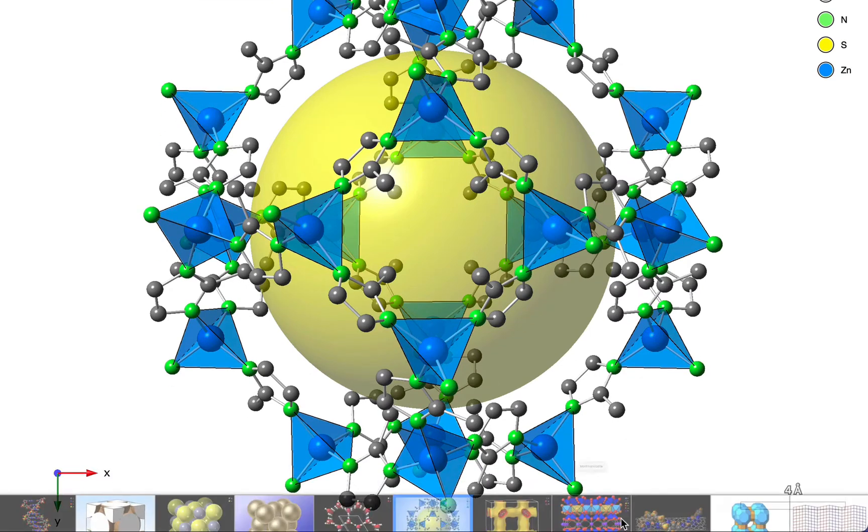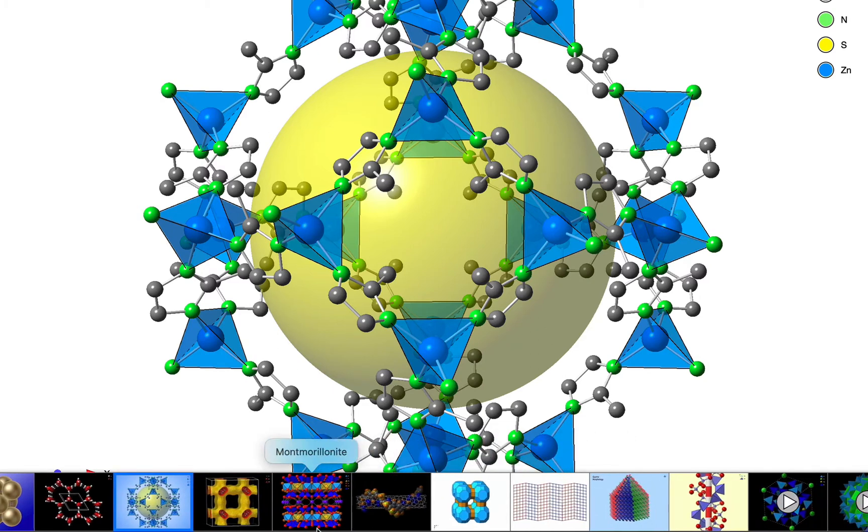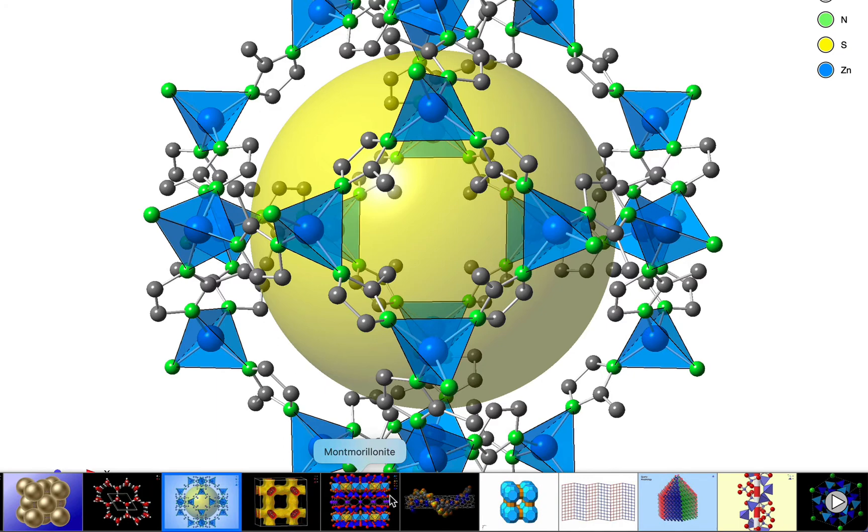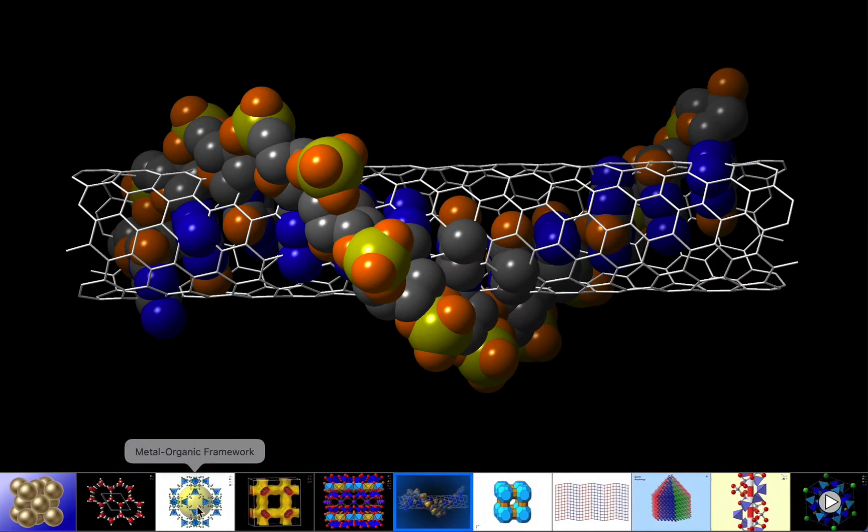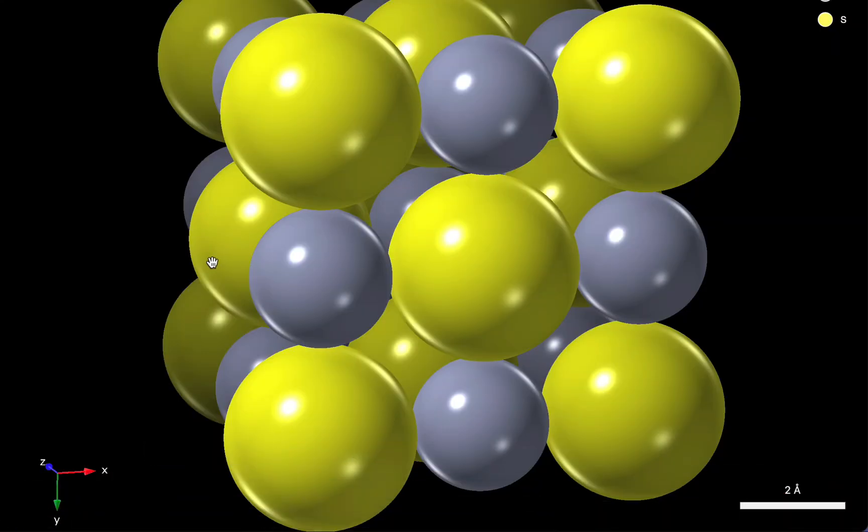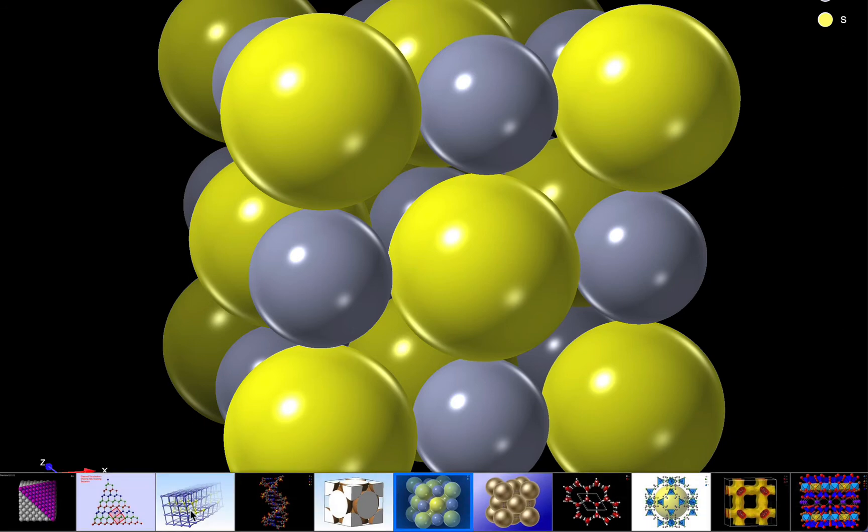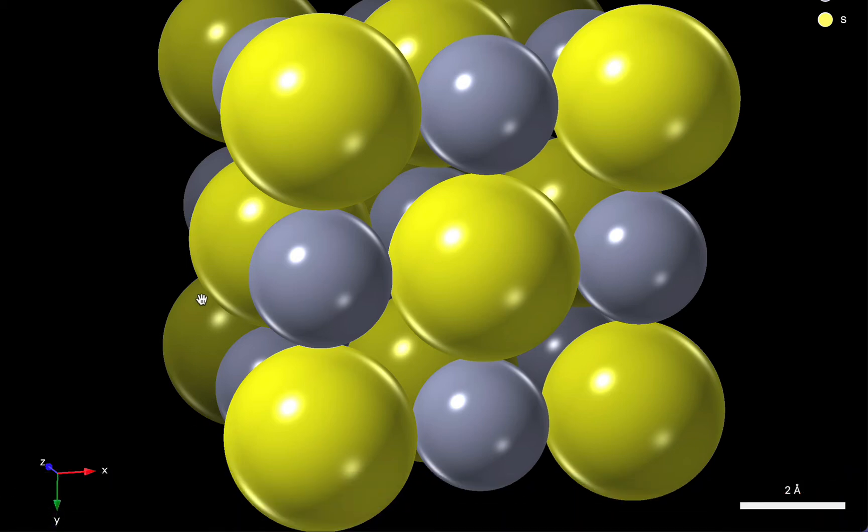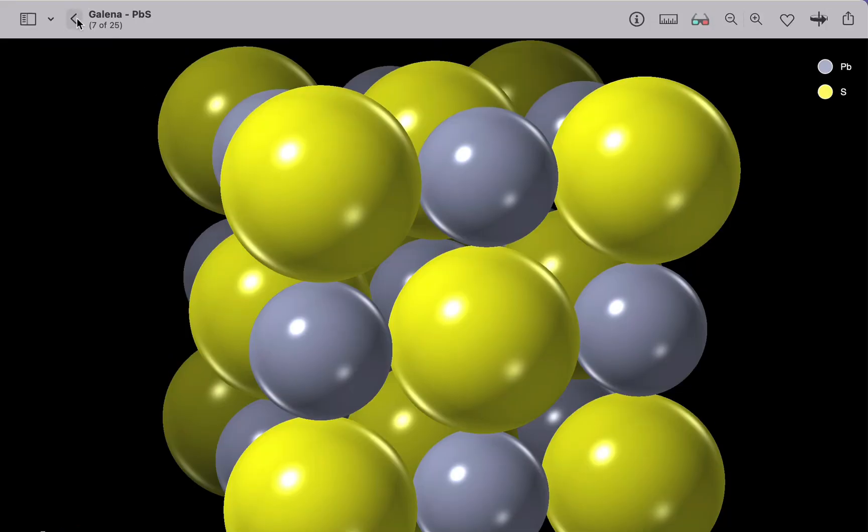If you move the mouse down to the bottom of the screen, then we see a file strip which represents all of the structures in the current folder. Now you can click and drag the file strip with the mouse to reposition it. Or if you have a trackpad, we can slide the strip along and we can just click on individual structures to load them into the window. If you move the mouse up, the file strip disappears, move it down and the file strip reappears. And we can exit the viewer in one of three ways. You can press the Escape key. You can do what we did to view the structure in the first place, simply double-click. Or you can press the Back button in the toolbar.